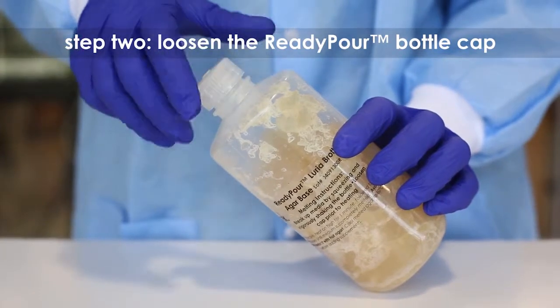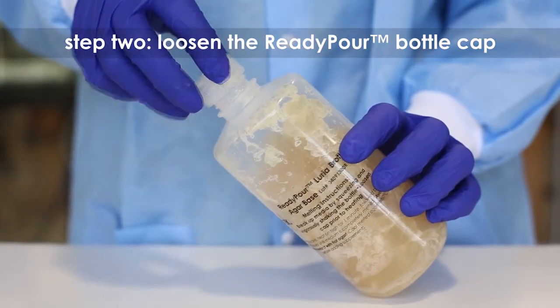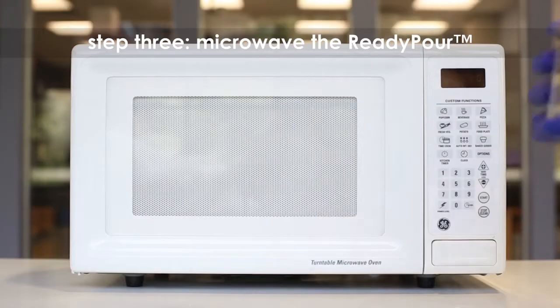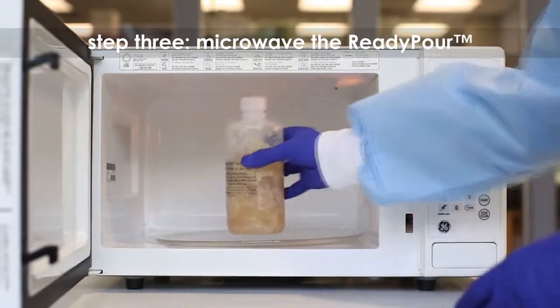Step 2: Loosen but do not remove the cap on the ready pour bottle. This allows the steam to vent during heating. Step 3: Microwave the ready pour agar on high for 30 to 60 seconds to start the melting process.